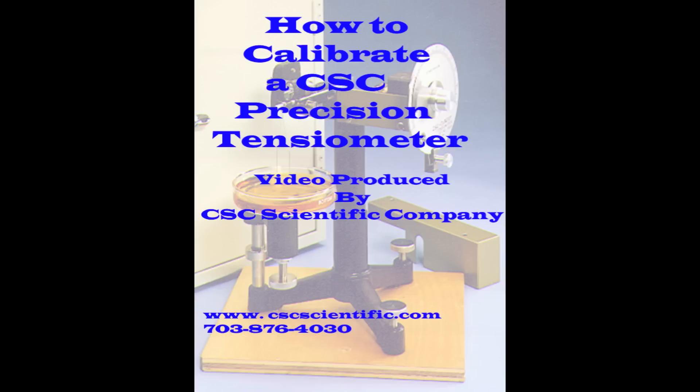This video covers calibration of a CSC precision tensiometer, part number 70535. When you need to find out if your tensiometer is performing correctly, you need to check it against a known standard or perform this calibration procedure.